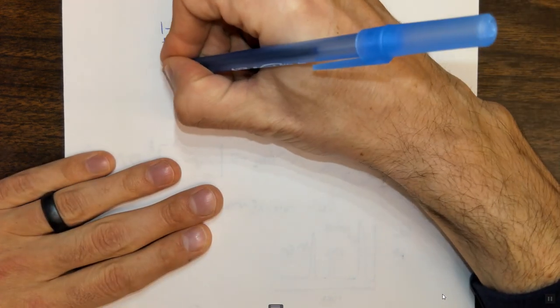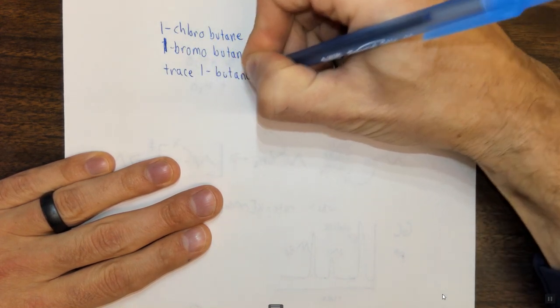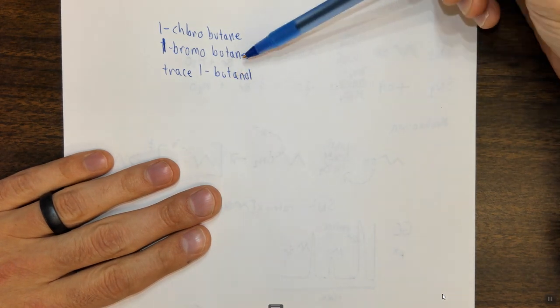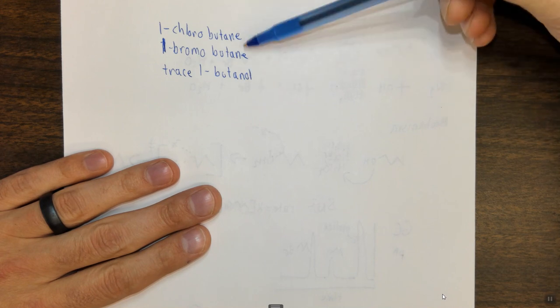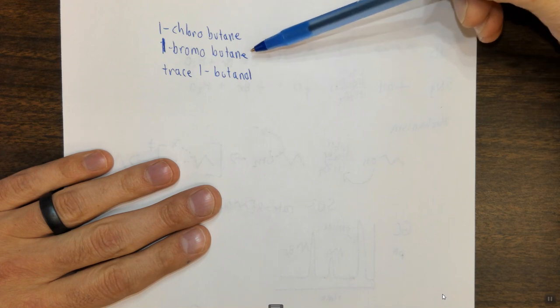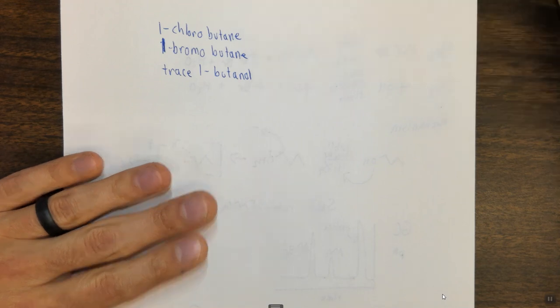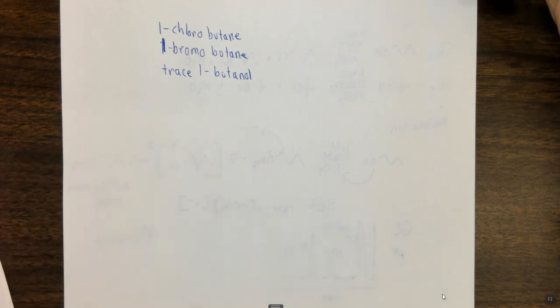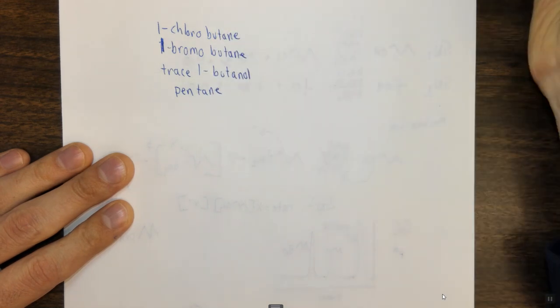So you could put trace 1-butanol on the separation scheme, or you can skip trace 1-butanol on the separation scheme. The argument for 1-butanol is that the chances are the reaction doesn't go 100% to completion. The argument against it is it's the limiting reagent, so there isn't going to be very much of it left. Use your judgment. It doesn't really matter. There's no right or wrong answer here. It's more of a philosophy question than a chemistry question. We're going to use pentane as our solvent.